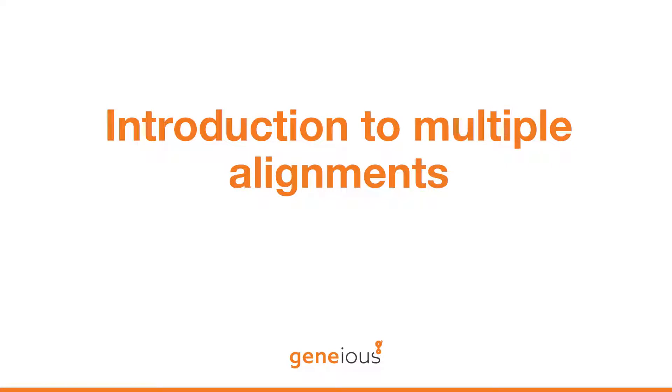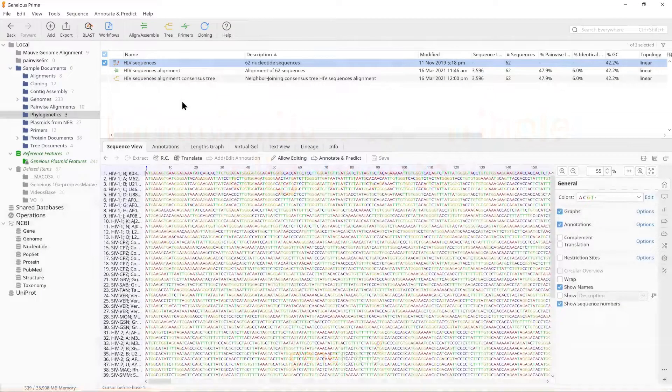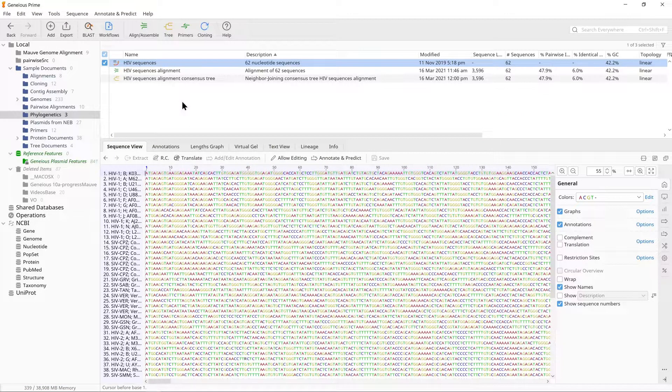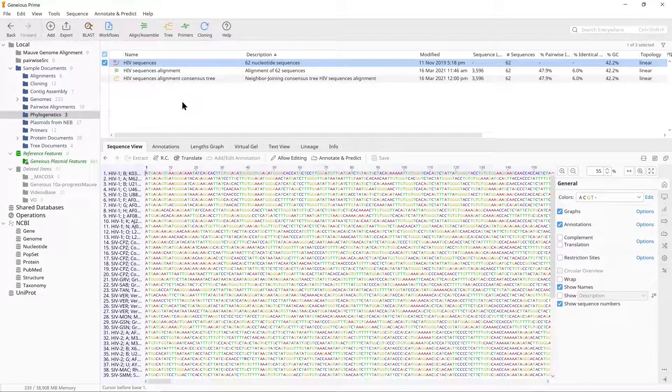In this video we will cover a quick overview of multiple alignments. Multiple sequence alignment is used to assess levels of homology among a group of sequences and is necessary before a phylogeny can be constructed.